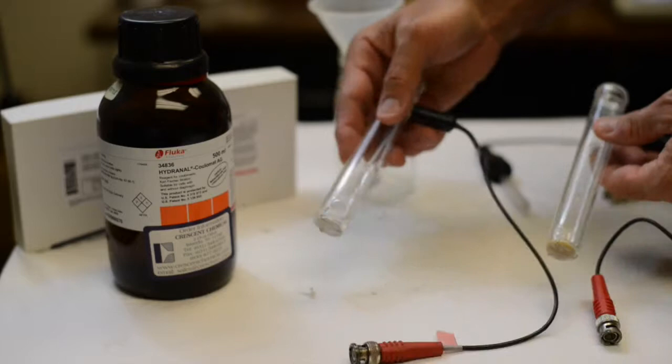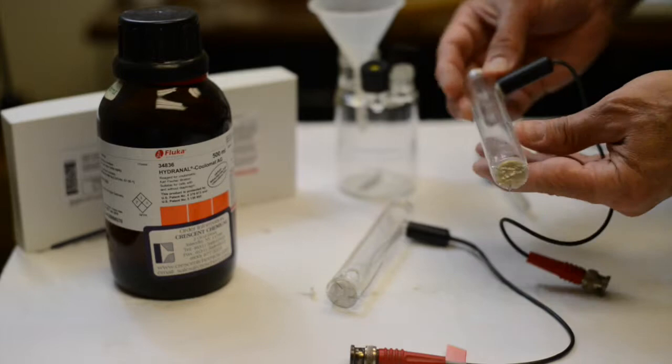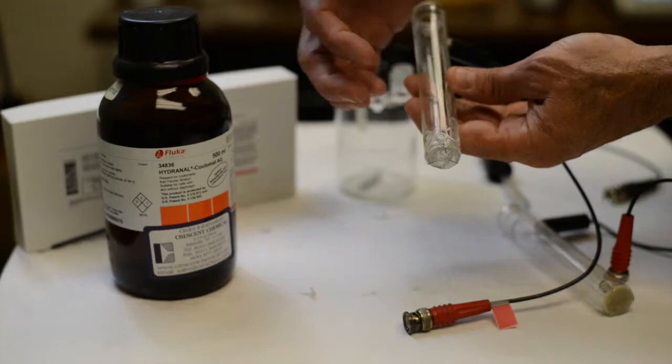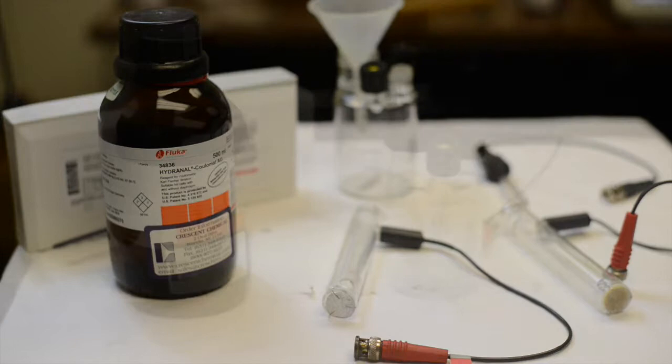Here we can see two generator electrodes. They appear identical but examining the bottom of the generator electrode you notice a white frit. The frit or wafer is designed to create a bottom so that a second reagent can be introduced. Conversely, notice the single reagent generator electrode does not have a wafer. Only the clear platinum screen can be seen.